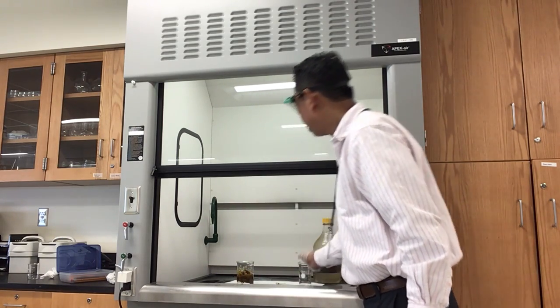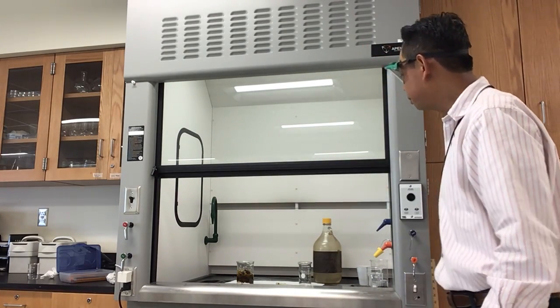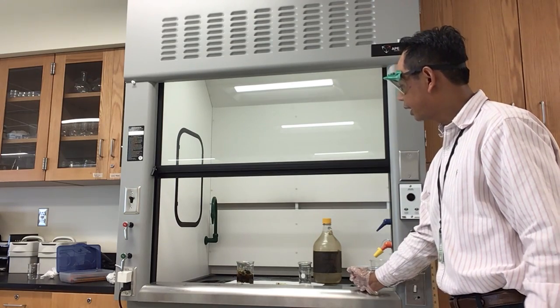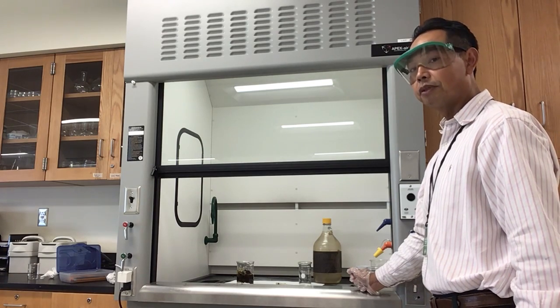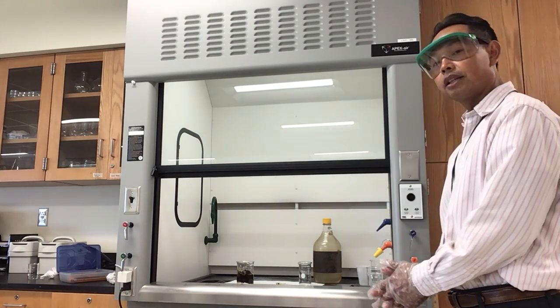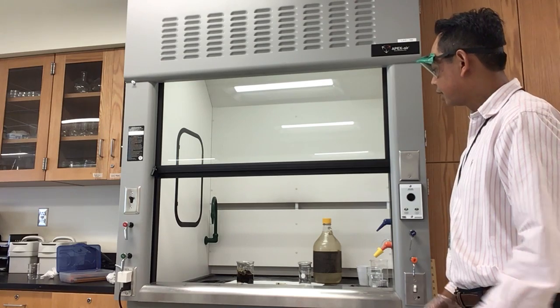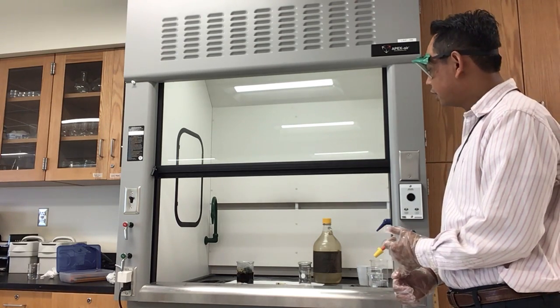Okay? So this is sugar. Initially it was white, grainy powder. Now, after mixing sulfuric acid into it, it's already changing color. Okay. You want to write the observation before the reaction. Now the reaction is going on. Right? And you want to draw or write, describe after the reaction. Later on, you're going to do claim, evidence, and reasoning.